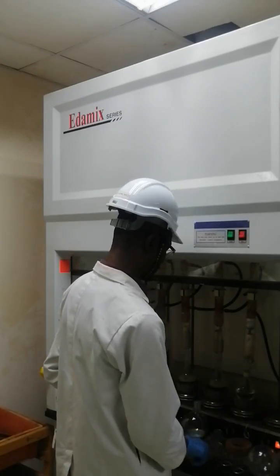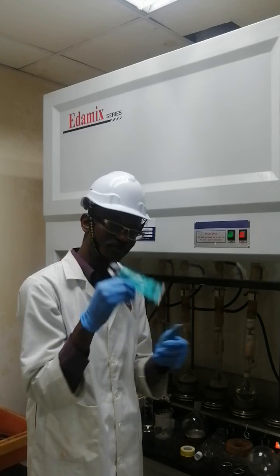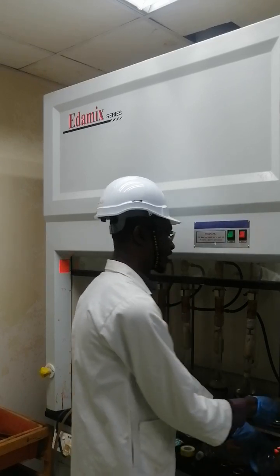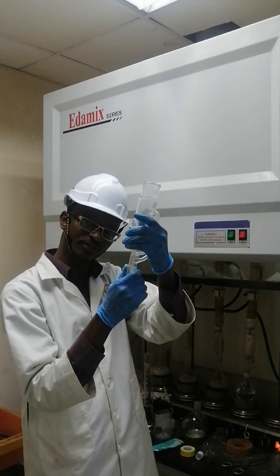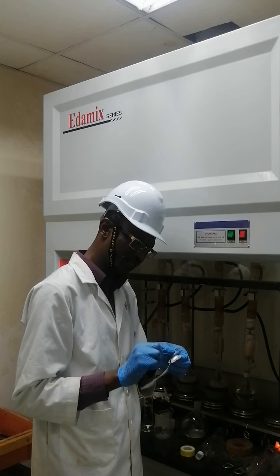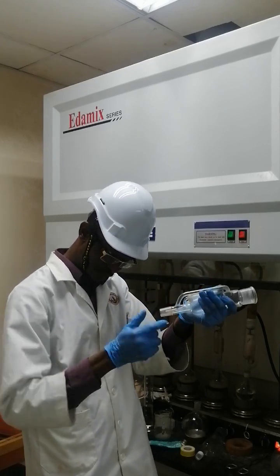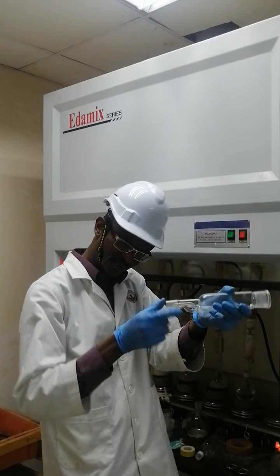What we can do is use what is known as high vacuum grease. If we have the high vacuum grease, we can smear it at the grinded joint between the extraction chamber and the flask. For example, we can place a very thin film of this grease. We rub it around the grinded joint, round and round. Make sure it's a thin film you are using.